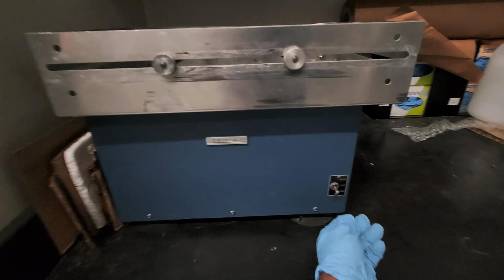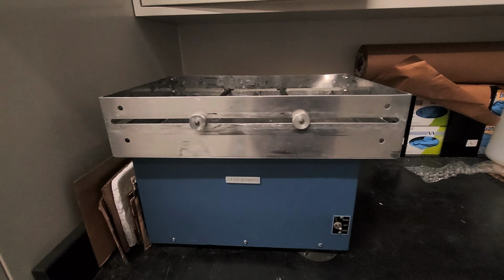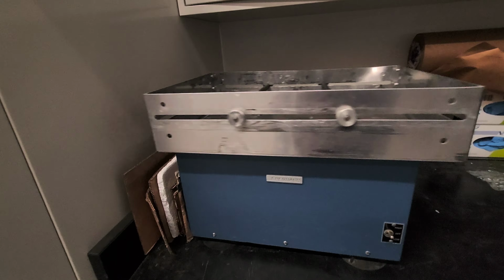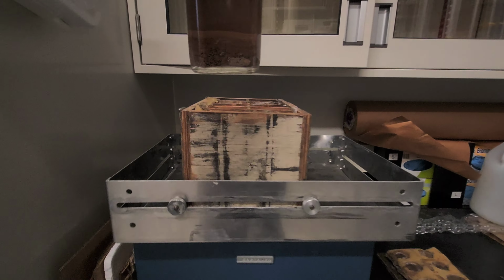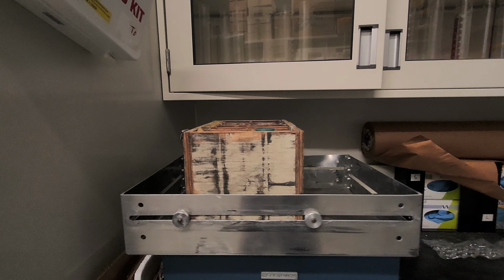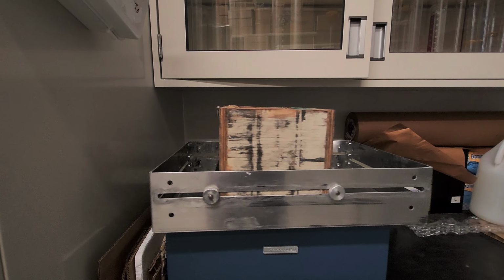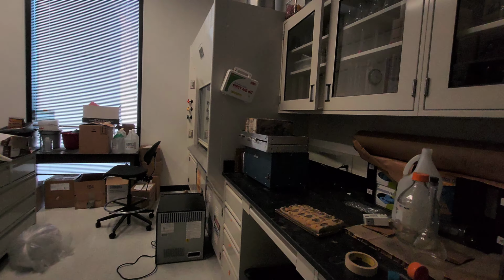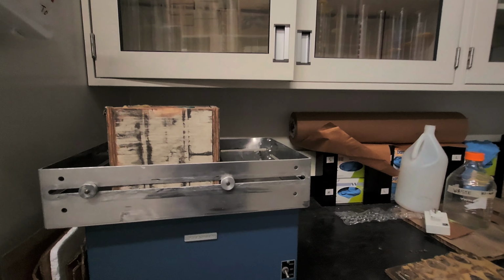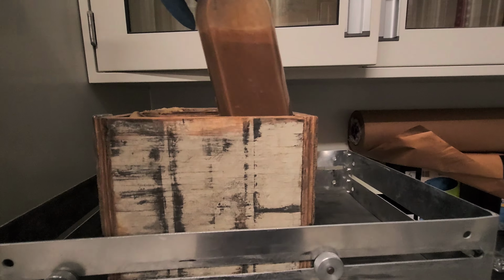Now we are putting this dispersing bottle in a reciprocal shaker for 4 hours. After 4 hours, we are taking it out.